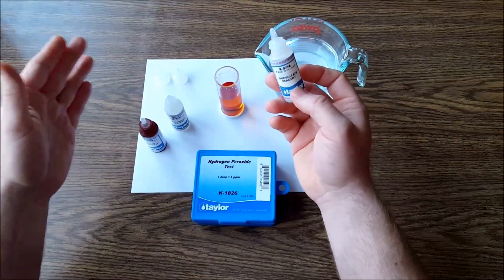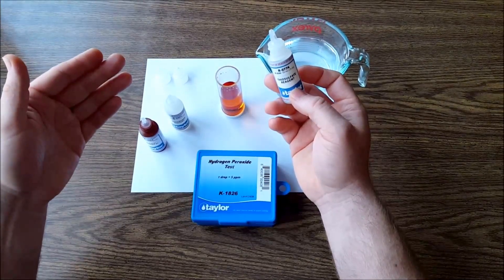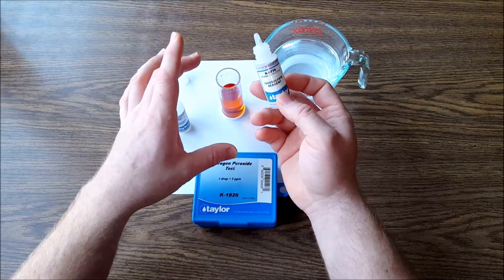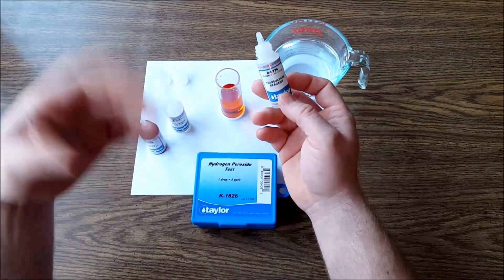When the color is completely clear, that's how much hydrogen peroxide you have in there. So however many drops that you put in there to make it clear, multiply that by five and that's your total parts per million of hydrogen peroxide that's inside of your float tank.